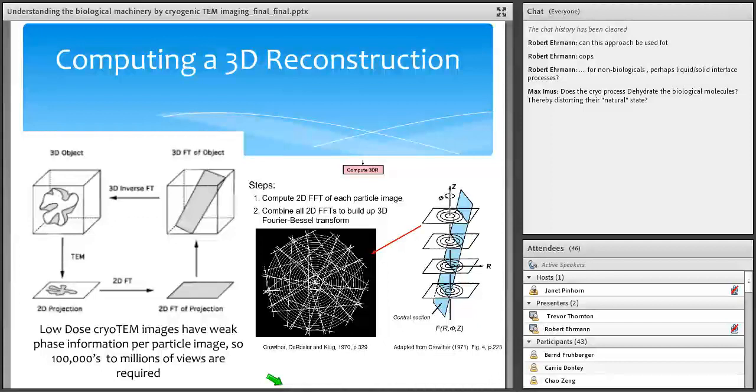And so these images go automatically onto a system that then corrects for motion that we have in our images, and that's what I'm going to talk about next.